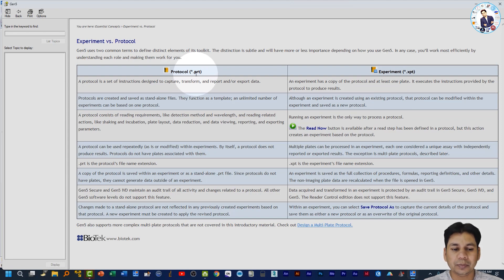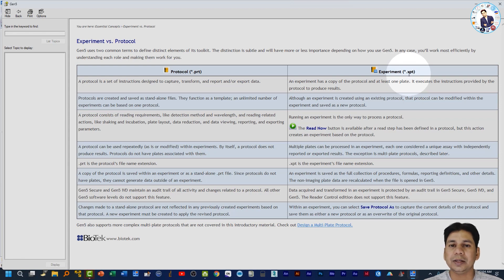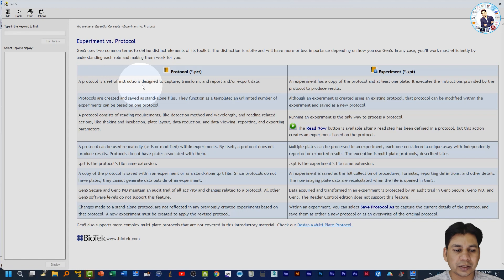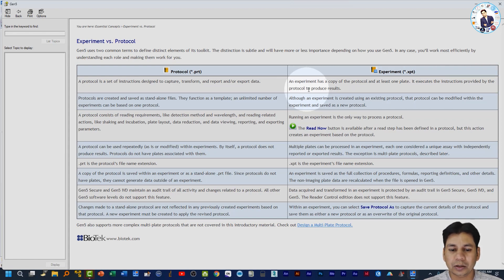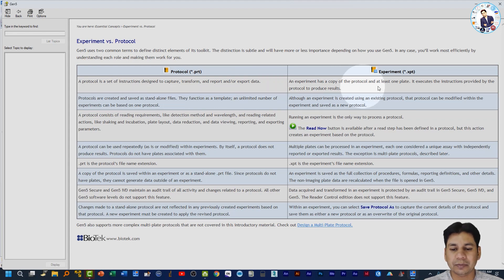The protocol file has the extension .prt and the experiment file has the extension .xpt. The major difference is that a protocol is a set of instructions designed to capture, transform, and report or export data. In the case of an experiment, it has a copy of the protocol and at least one plate, and it executes the instructions provided by the protocol to produce results.